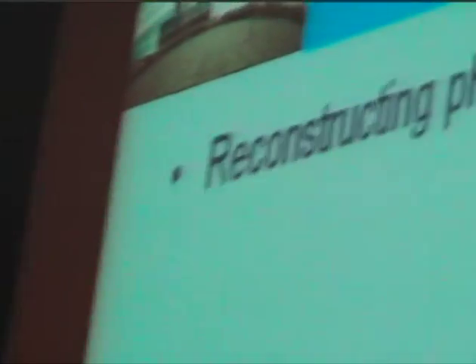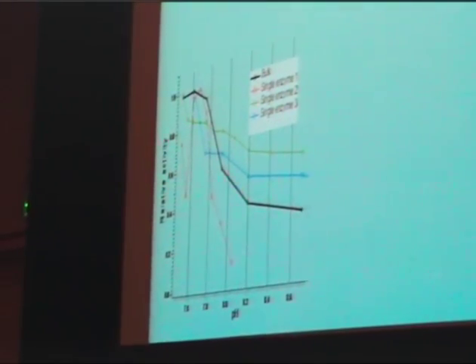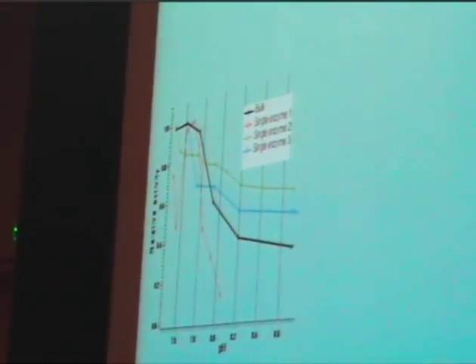Now, other things we're doing with fluorescence microscopy related to catalysis is, for instance, the construction of pH profiles of individual enzymes. And we see that not every enzyme responds to the same extent to the addition of base, for instance. Every single enzyme from what is supposed to be a homogeneous batch has a different pH optimum and is more or less susceptible to pH decrease.